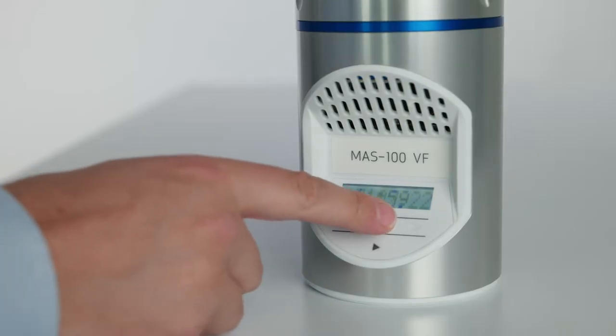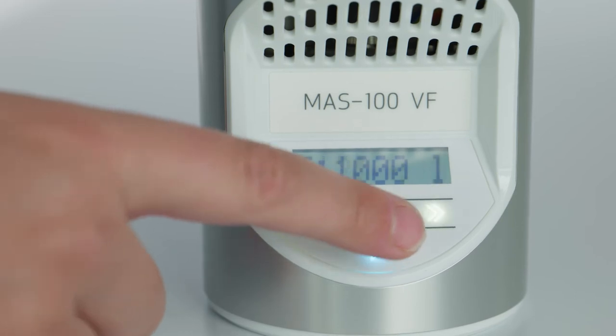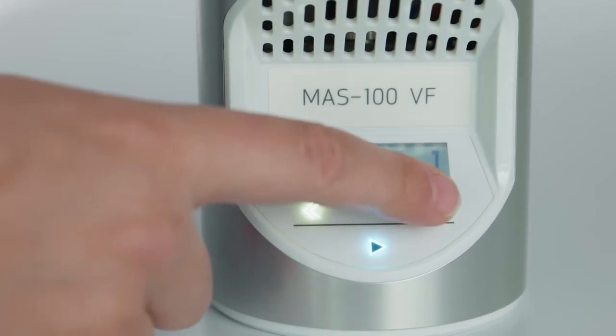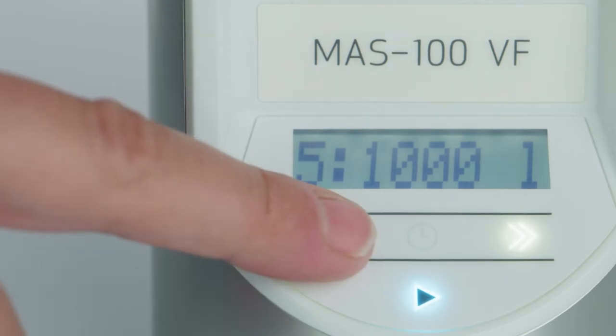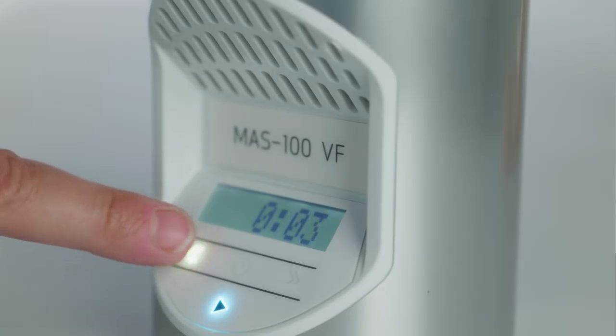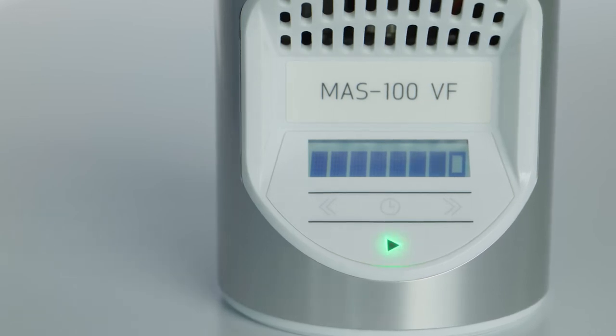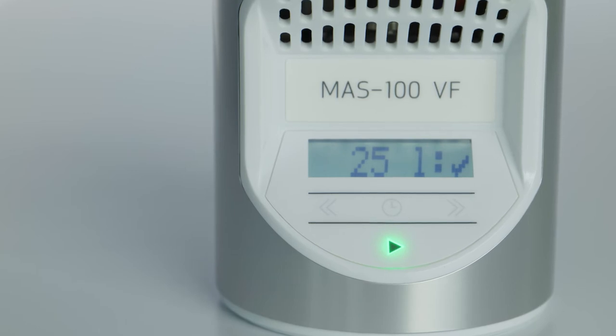The home screen shows the time. Touching the clock icon reveals the date for three seconds and then automatically falls back to the time. To start sampling, touch the start button once and the last used sampling volume is displayed. Choose another default volume by tapping the left or right button — if only one volume is enabled, this option is not available. To confirm the volume and start the sampling, tap the start button. If a sampling delay was set, the clock counts down and the start button flashes blue. Pro tip: the delay and the start can be aborted by pressing the left button. Once the measurement starts, the start button flashes green and the bar in the display shows the sampling progress. When finished, the LED is green and the sample volume is displayed.